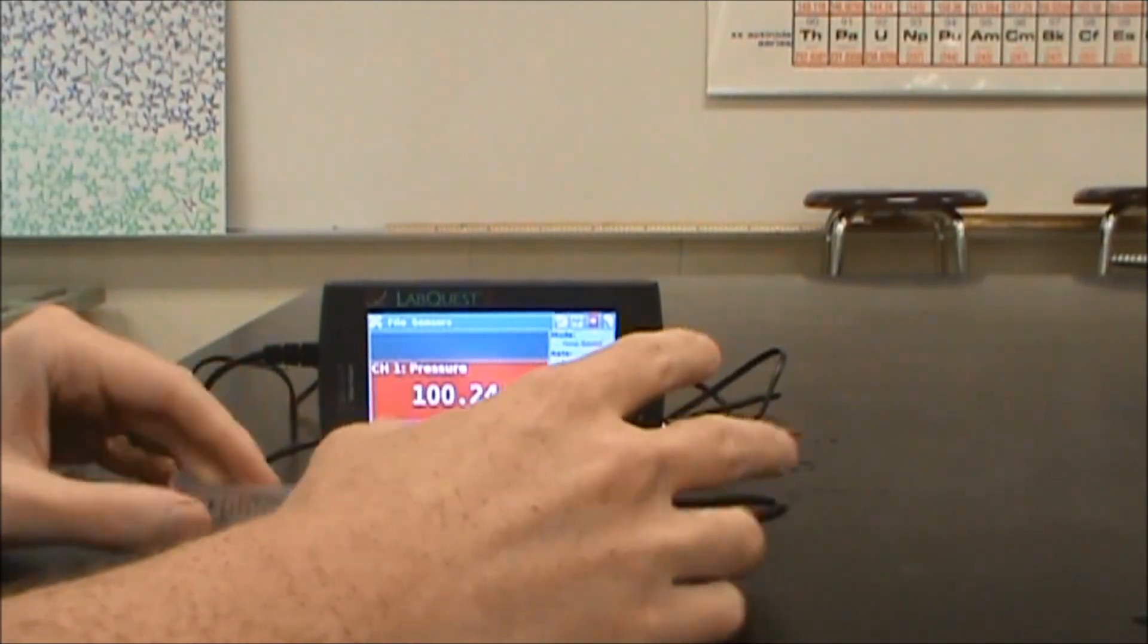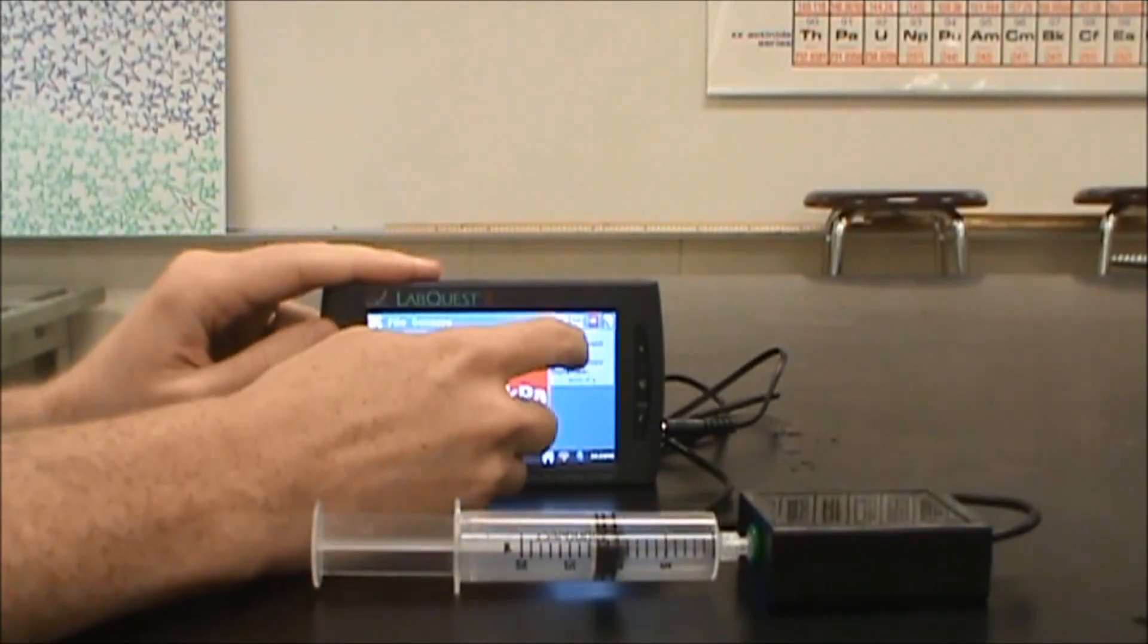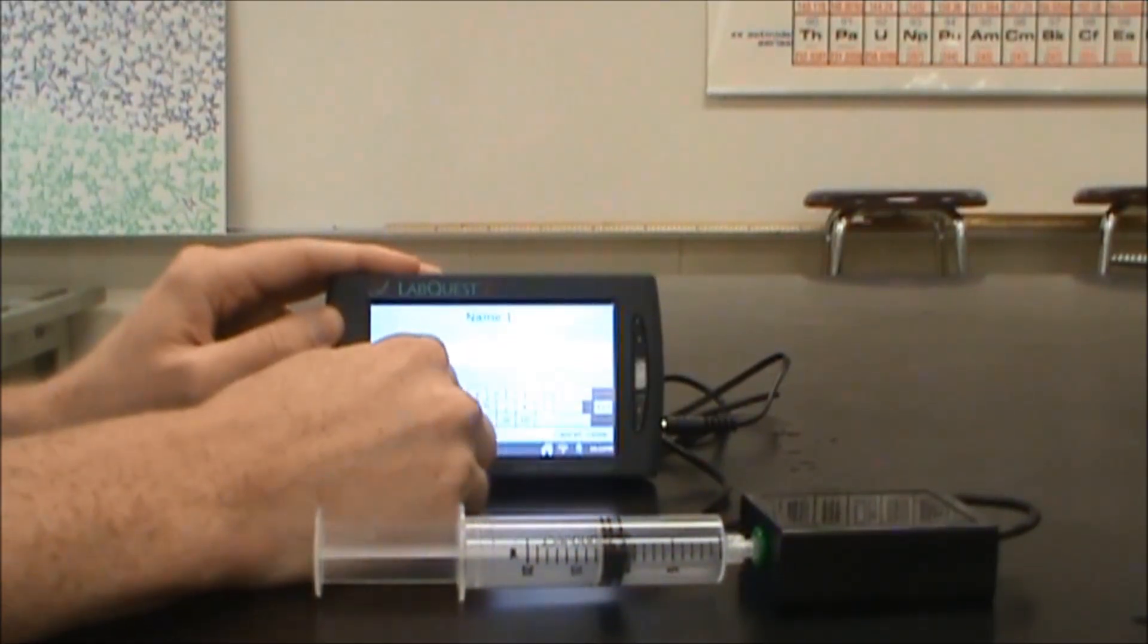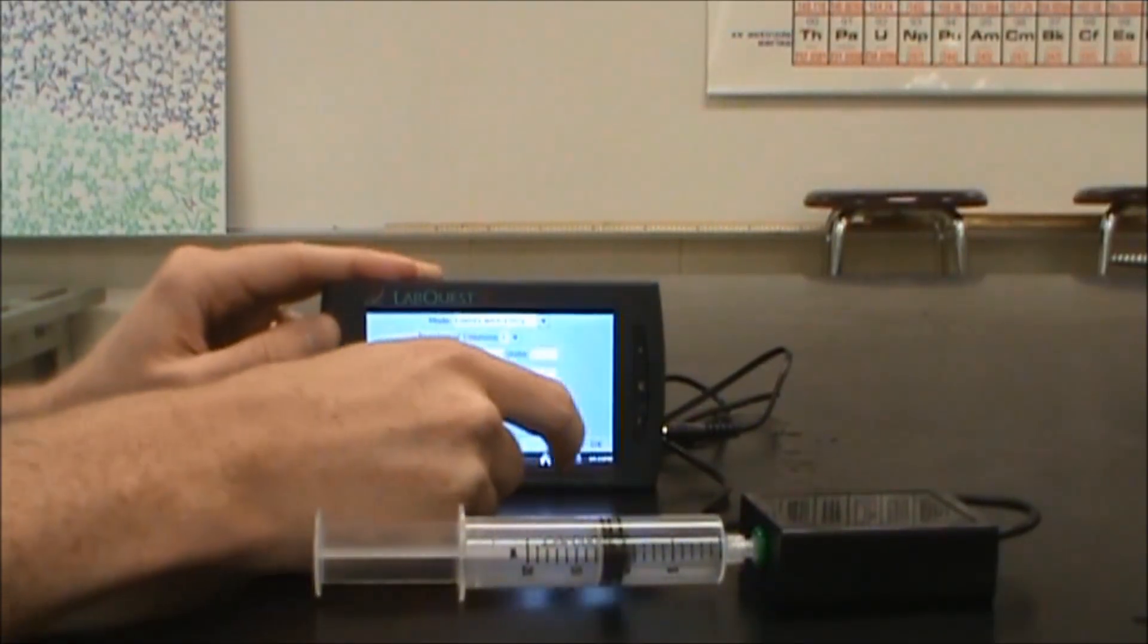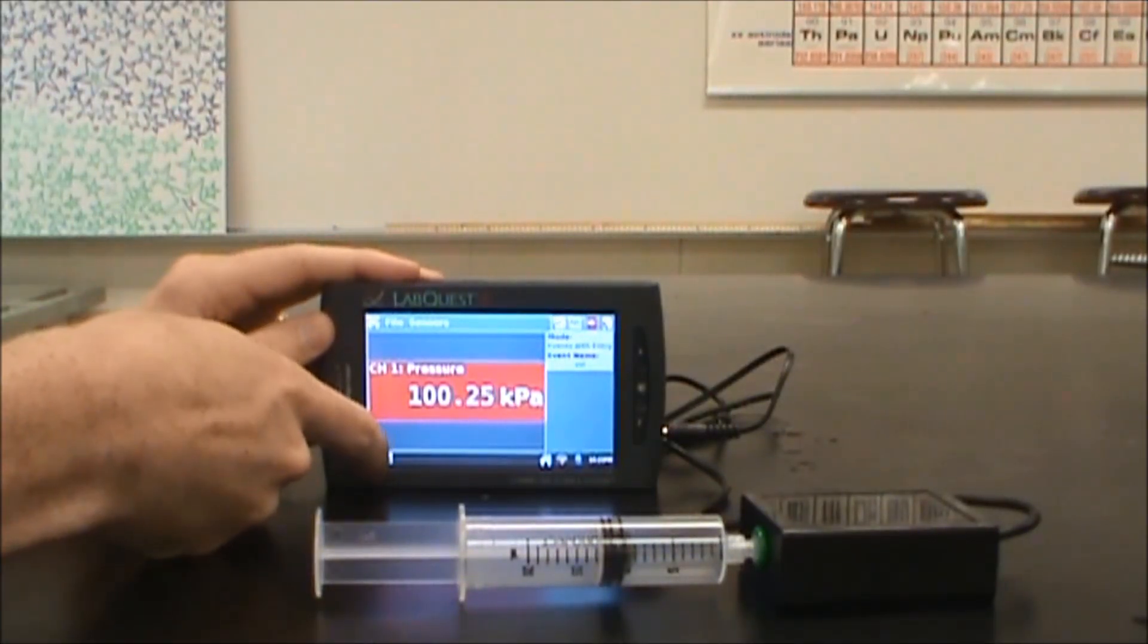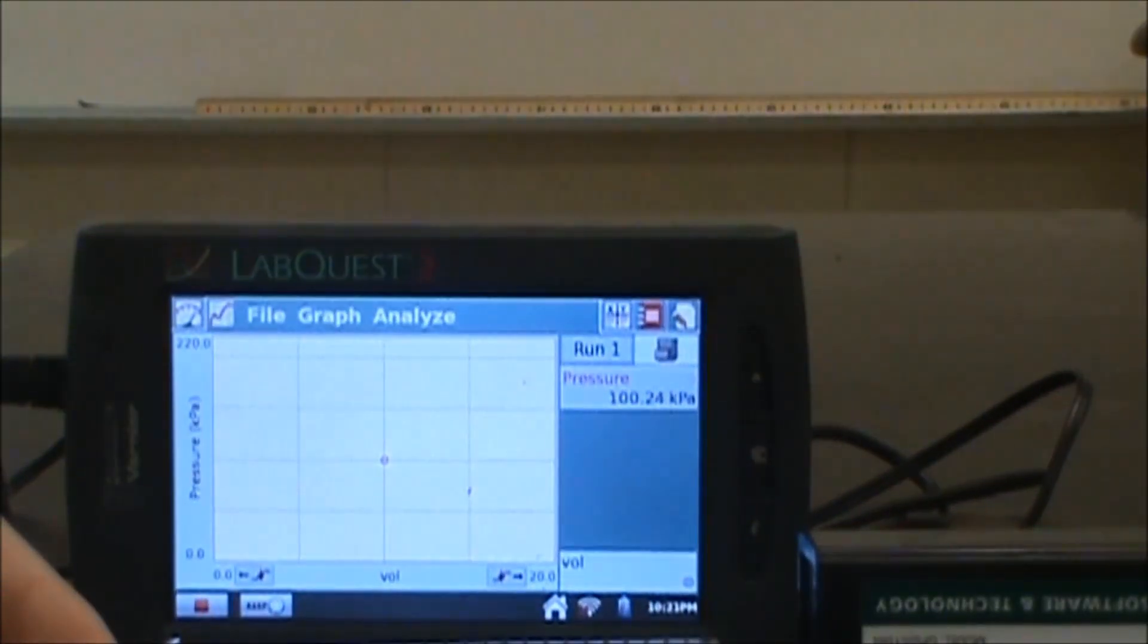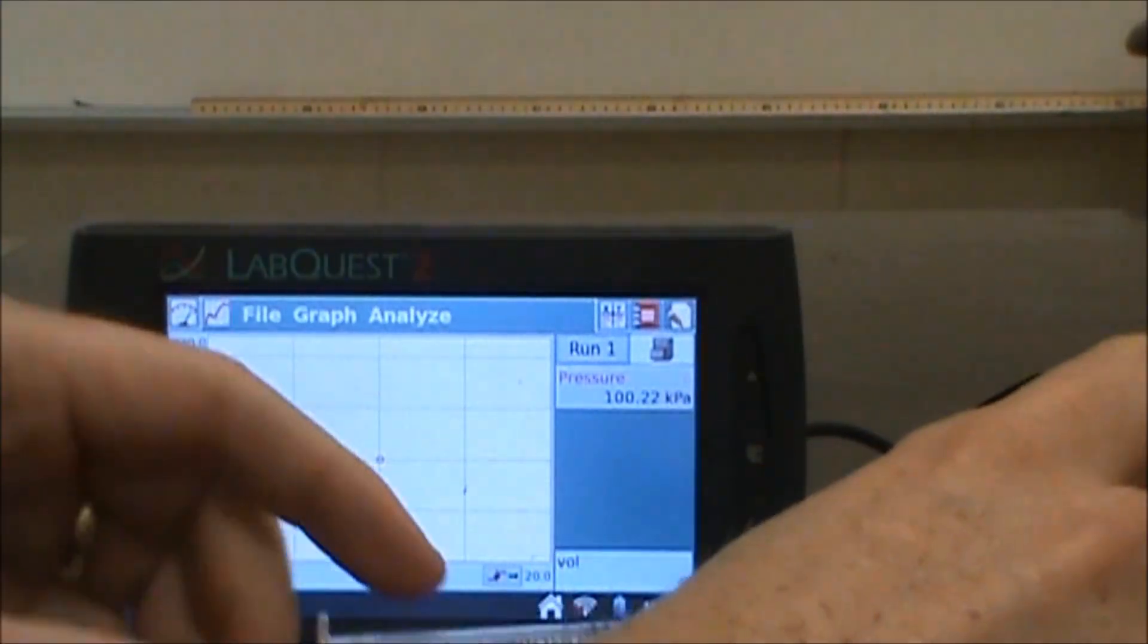I'm going to go ahead and hook that up. I'm not going to over tighten or anything crazy. To get this to function in the way you want, you want to go from time-based mode to events with entry. We're going to do the volume manually. I'll just put vol there. When I hit play now, this is going to allow me to figure out what the pressure is inside of here at each given volume.